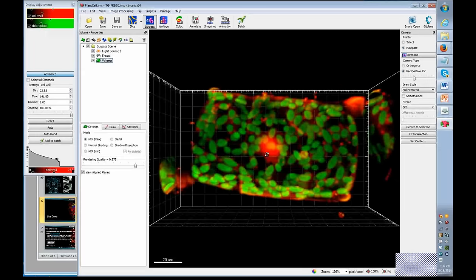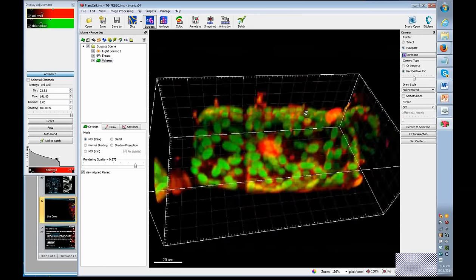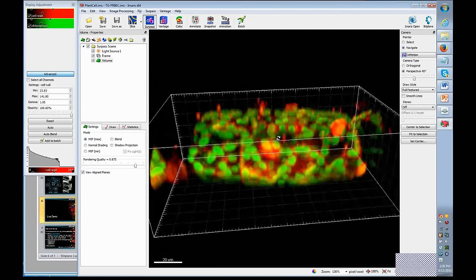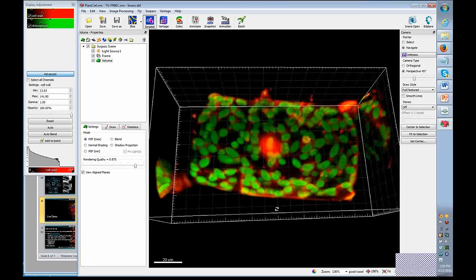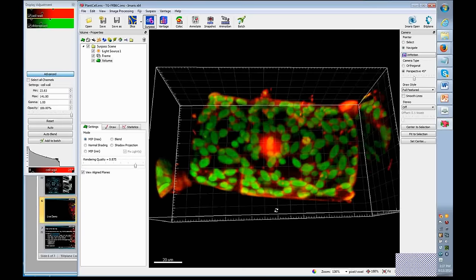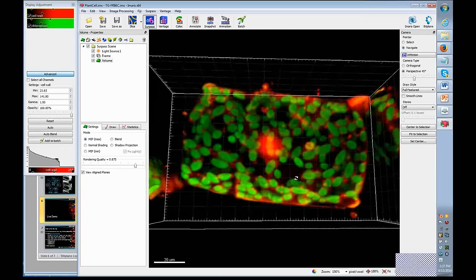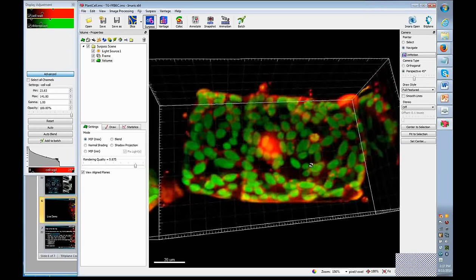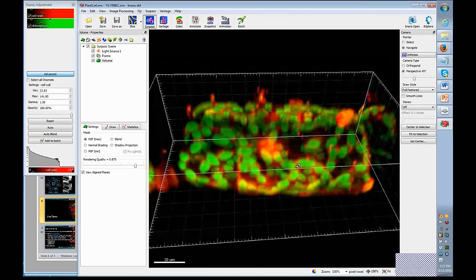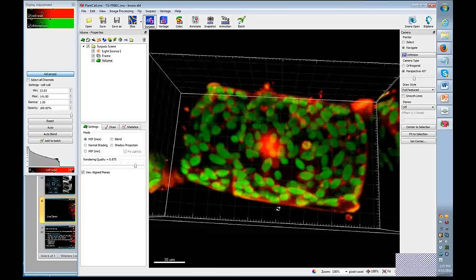Okay, so here we have some objects. They are of fairly similar size. They are fairly blob-like, but their shape, their elongation is not along the z-axis. And that ellipsoid spot tool is really only able to deal with the z elongation that occurs when you're detecting objects that are close to the z-step size or the z resolution of your optics, where they tend to get stretched out a bit for optical and/or sampling reasons. Here, there's an arbitrary orientation to the elongation, so ellipsoid spots would not really help us.